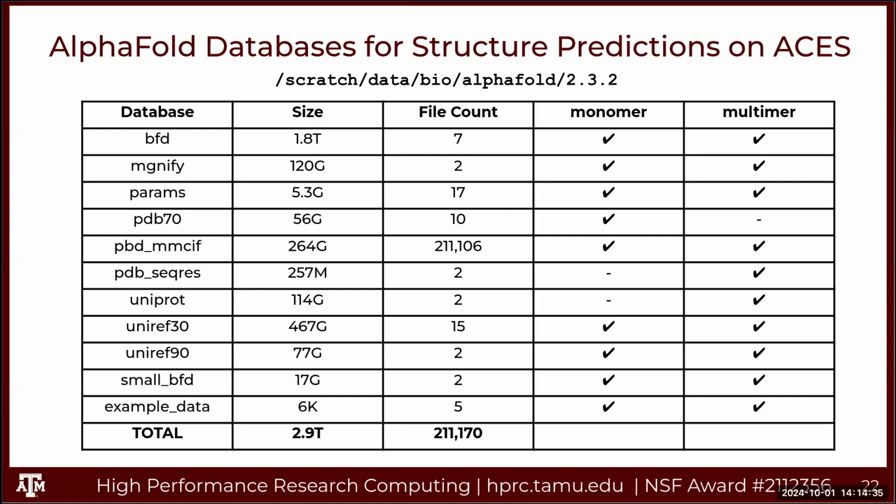So it's best to just use this shared location, instead of using up your quotas trying to save the database into your Scratch directory. If there is an updated database and we do not have it, and you recognize that there's a newer version of one of these UniRef90s or 30, you can let us know and we'll add that.